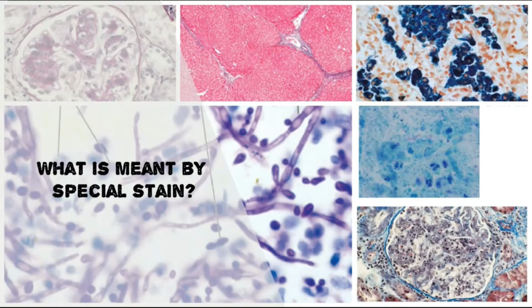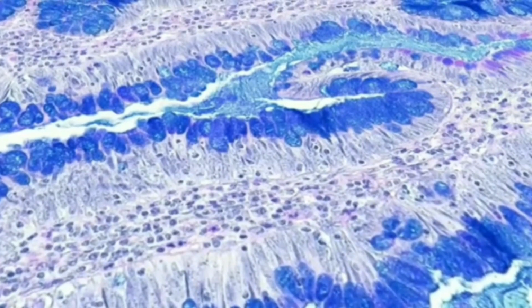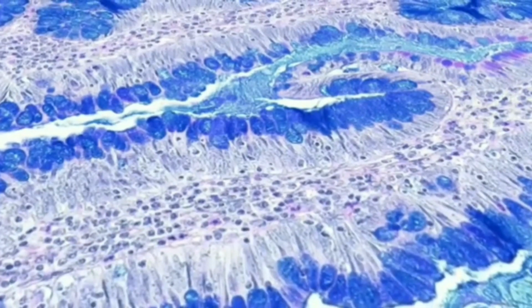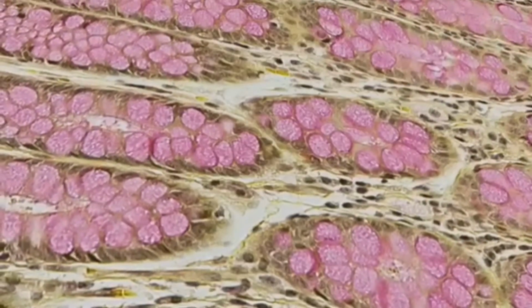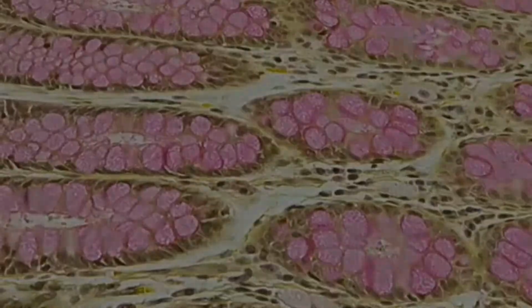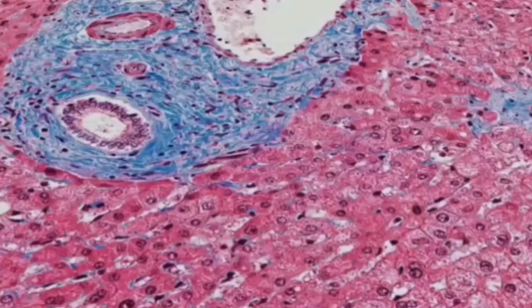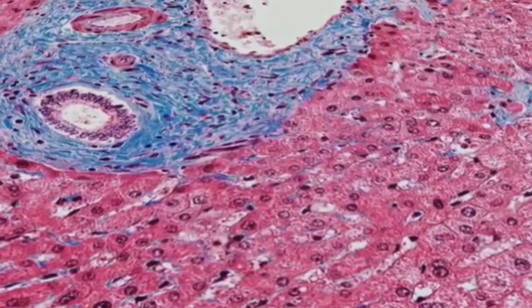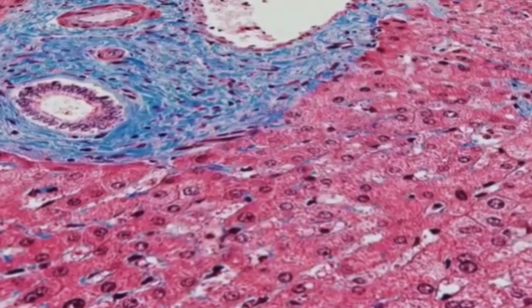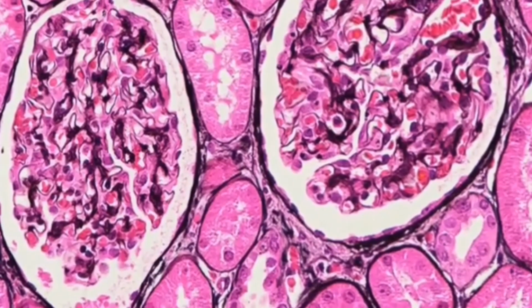However, examination of hematoxylin eosin stained tissue may raise some questions. Special stains are important on this basis because they can answer specific questions. They allow the target substances to be identified based on their chemical character, for example, calcium, iron, DNA, and RNA, or biological character, for example, connective tissue, nerve fiber, and myelin, or pathological character, for example, microorganism and amyloid.